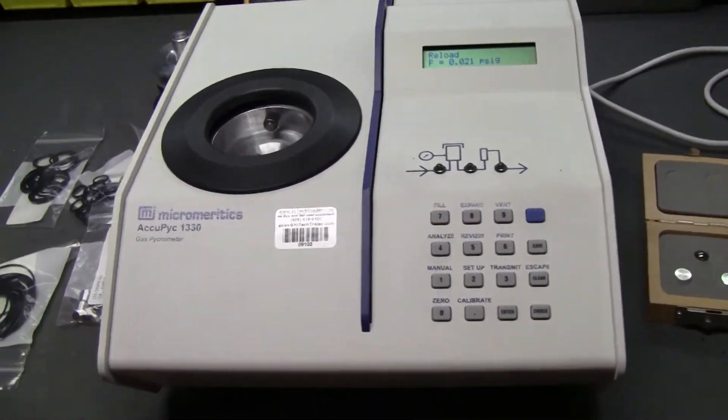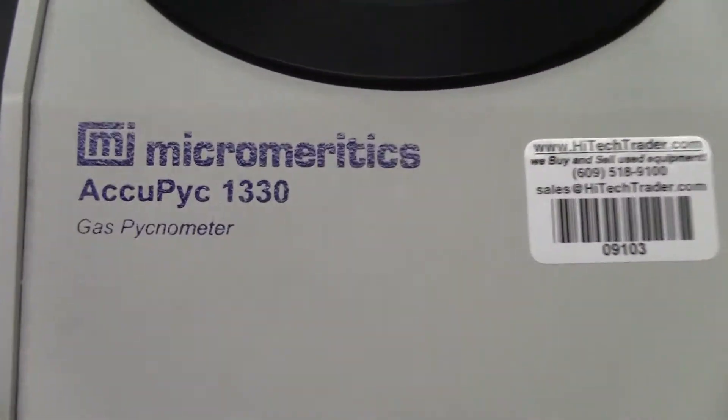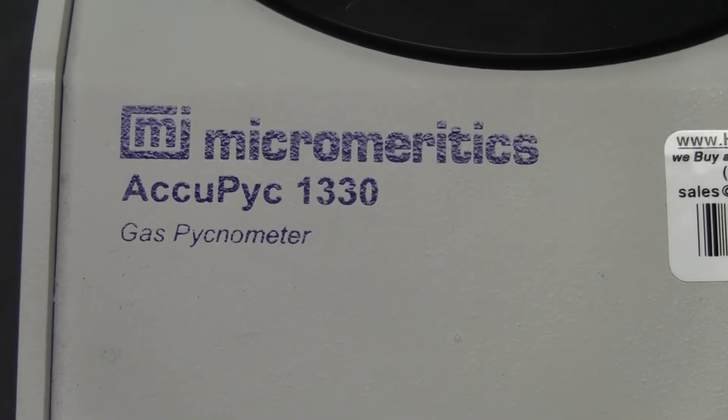Hi, this is Michael Natow from Hitech Trader. Today we're looking at the AcuPic 1330.